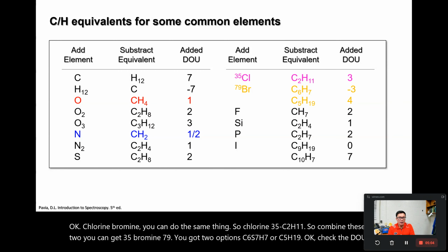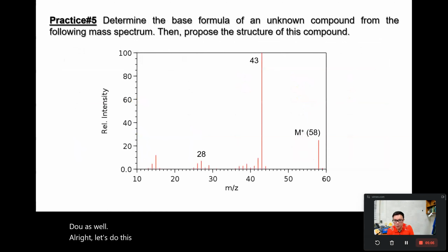All right, let's do this. Try this on your own. Okay, we just used rule 13 on 58. I want you to propose the structure of this compound. Let's go.